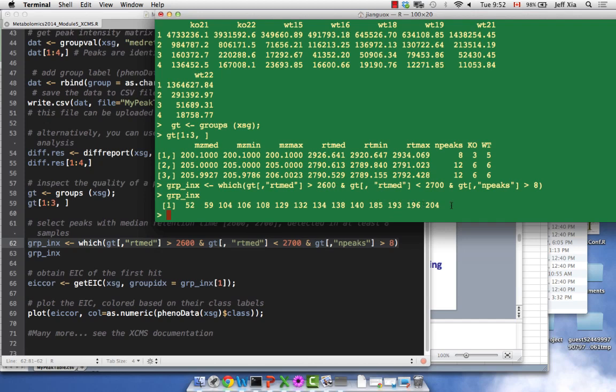Where is this output different? Probably I will give one more correction. Okay, you got the fun. You guys all the same, so thanks. Oh, yeah. In between I showed one, probably I did a binning correction a little differently.